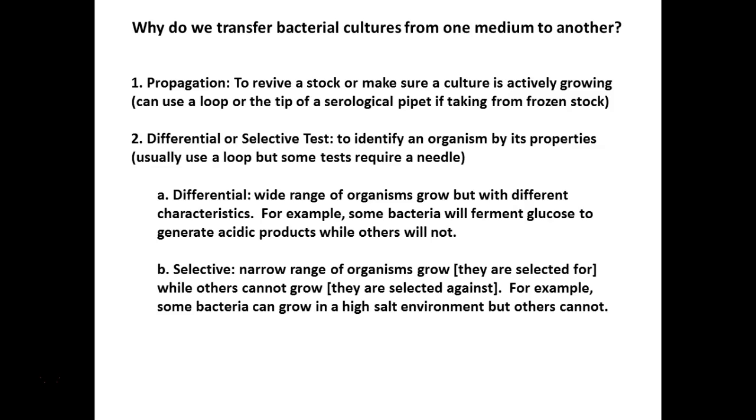And you put a mixed culture onto the differential. A lot of things will grow, but the fermenting bacteria will do their fermentation, and that lets you know that you have that bacteria in the culture. Yeah, because it's going to look different from the rest on the plate. That fermentation process will look different. Or the media will look different, or the organisms, or both. And you guys will see that later on in the semester.